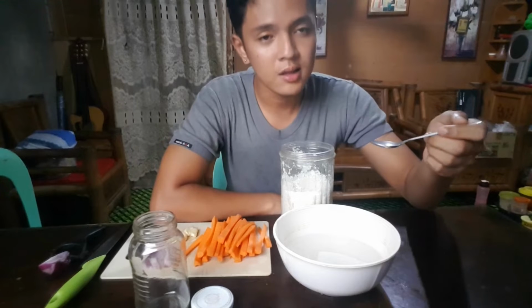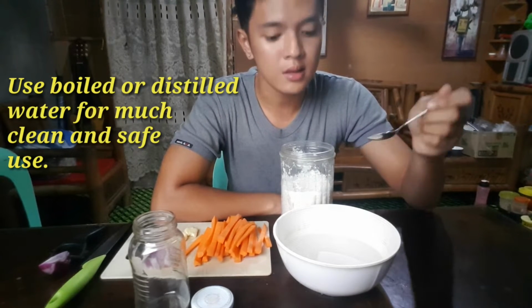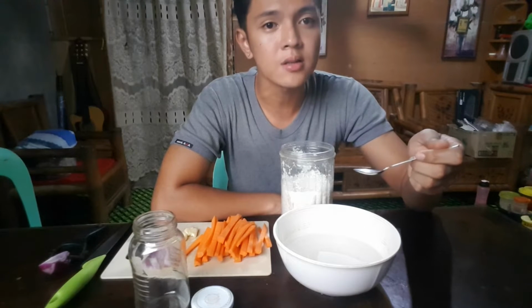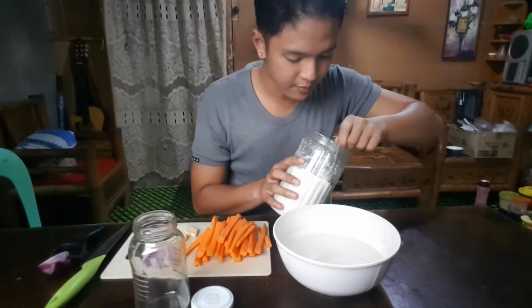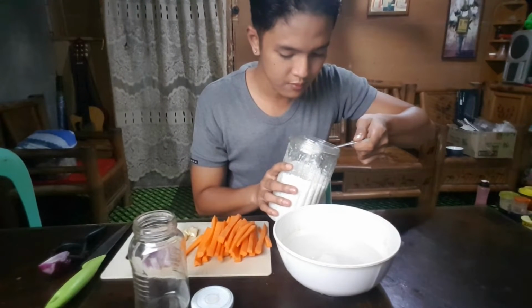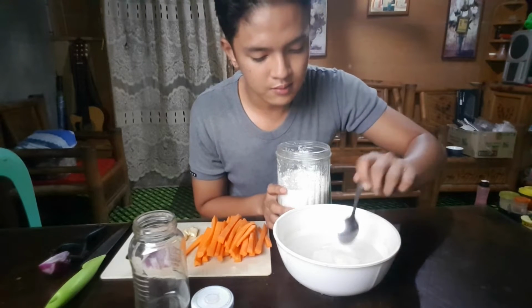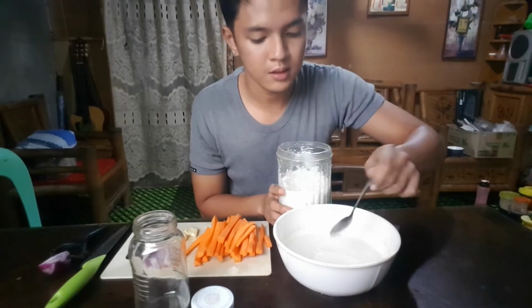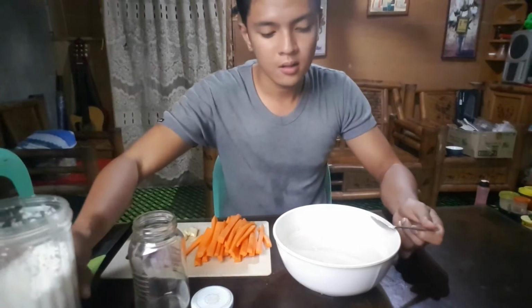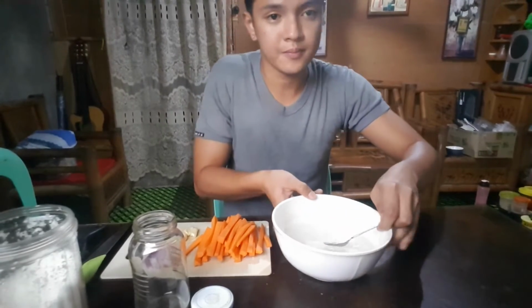And take note that the water that I'm using is already boiled earlier in order to ensure that this water is free from contamination and harmful microorganisms. So, let's go. 1 and 2. After that, make sure that you mix well the salt to water.